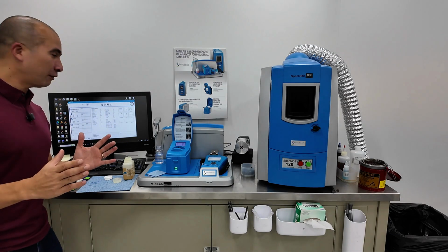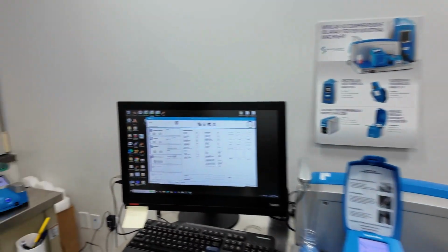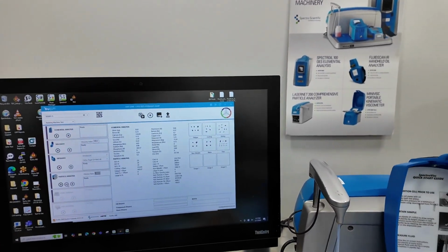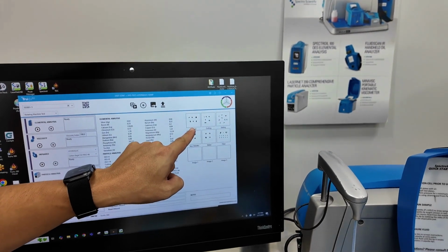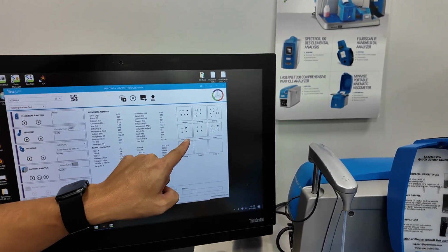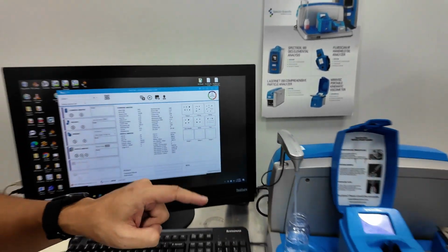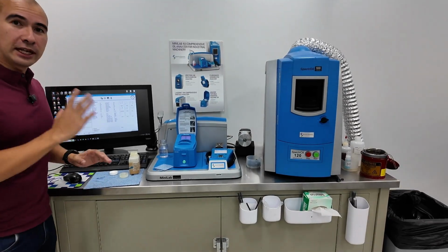All right, so our LaserNet Fines analysis is done. I'll have to bring this a little bit closer. So you can see on the computer here, we've been able to identify, based on the size and the shape, fatigue, cutting wear, sliding wear, non-metallics. I think that's based on the reflectance. You've got water bubbles as well as fibers. All right, so that's LaserNet Fines.